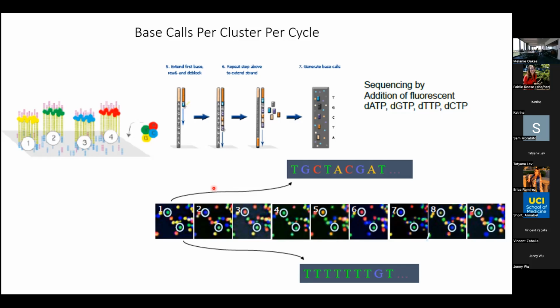Okay. So for instance, if you're giving me an RNA-seq library, if we're going to sequence RNA, all right, typically, if we're doing bulk, I will suggest that the minimum amount of reads should be 20 million. And what I mean by that is it's 20 million and it's going to be paired 100 reads.